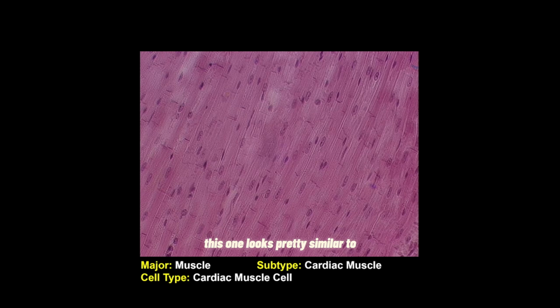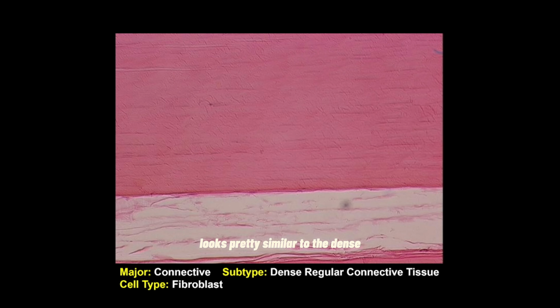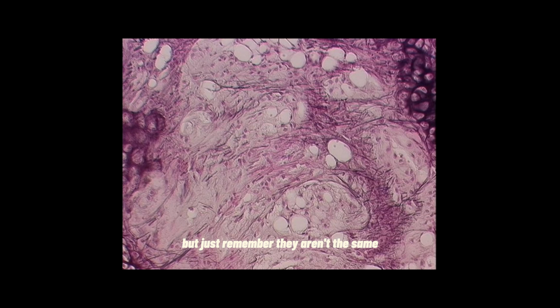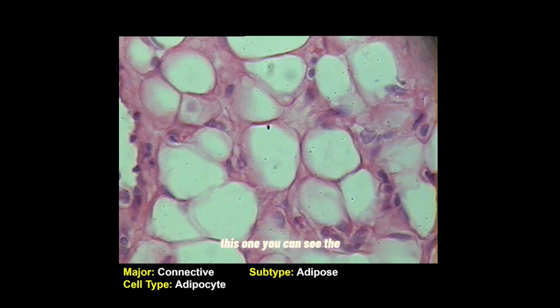This one looks pretty similar to the other one that we just looked at. Looks pretty similar to the dense regular connective tissue, but just remember, they aren't the same. This one you can see the actual individual nucleuses. The other one you cannot.